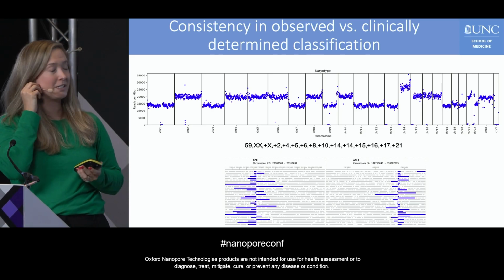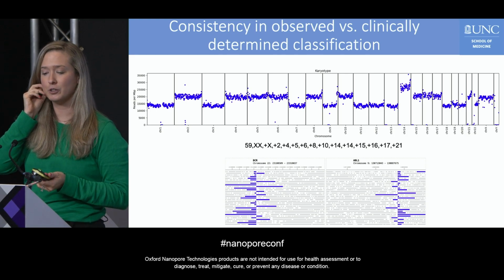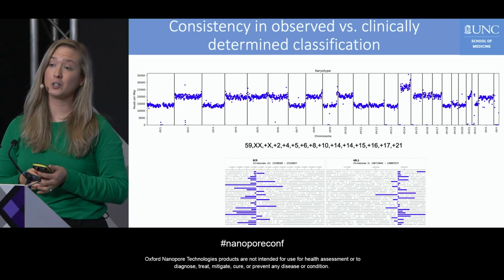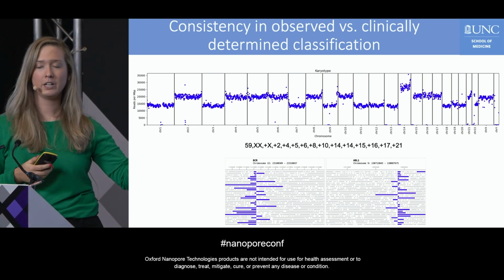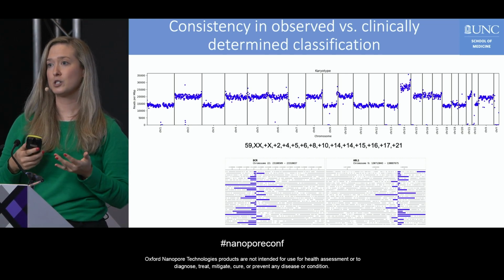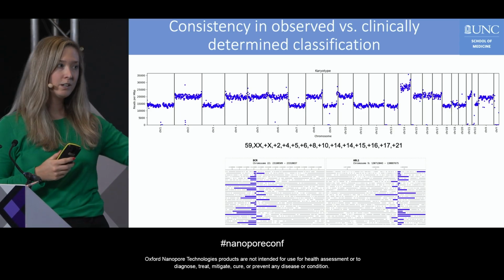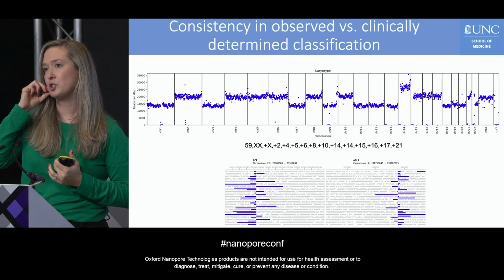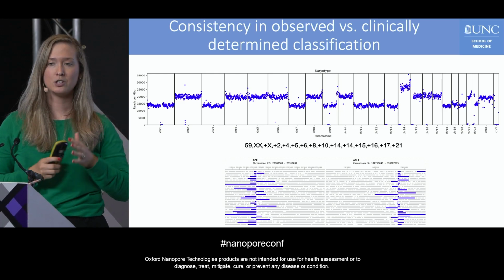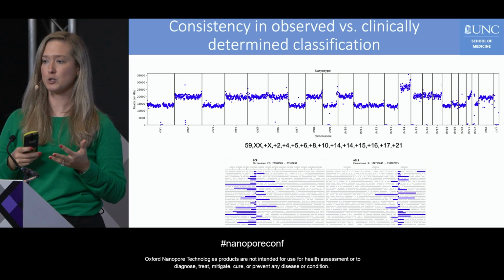If we look a little bit deeper, we can also see these changes at the gene level. And for this particular instance, we see both. And so what I'm showing you here is fusion support for a BCR-ABL1 fusion. The bars in blue are reads which map to both genes. And so these are roughly the first 30 reads that support this gene fusion.